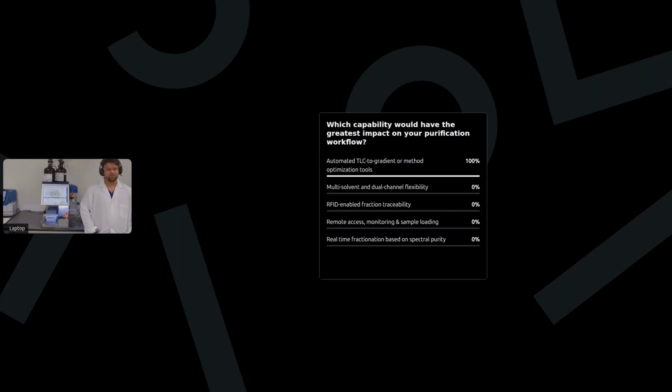All right, Austin, I think we're ready to share the results. Our most popular answer by 100% was automated TLC to gradient or method optimization tools.